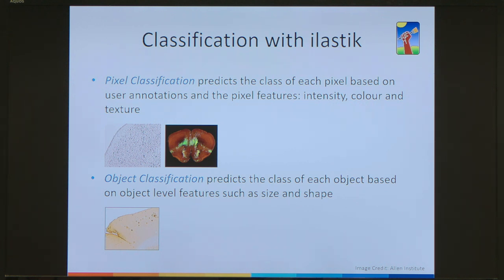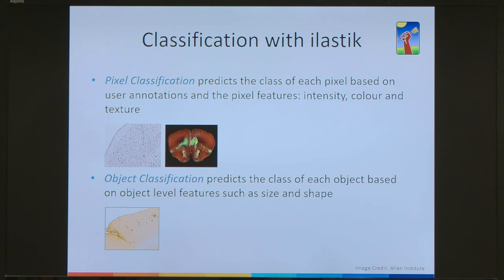Going back to ilastik — for classification it has two main workflows. The first is the pixel classification workflow, where you upload your images and classification is based on user annotations that you manually place yourself, plus pixel features: intensity, colour, and texture. The added value of using ilastik over traditional intensity thresholding is that it also takes into account the colour and texture of your image. Often that's all you need to do, and then you can export segmentations.